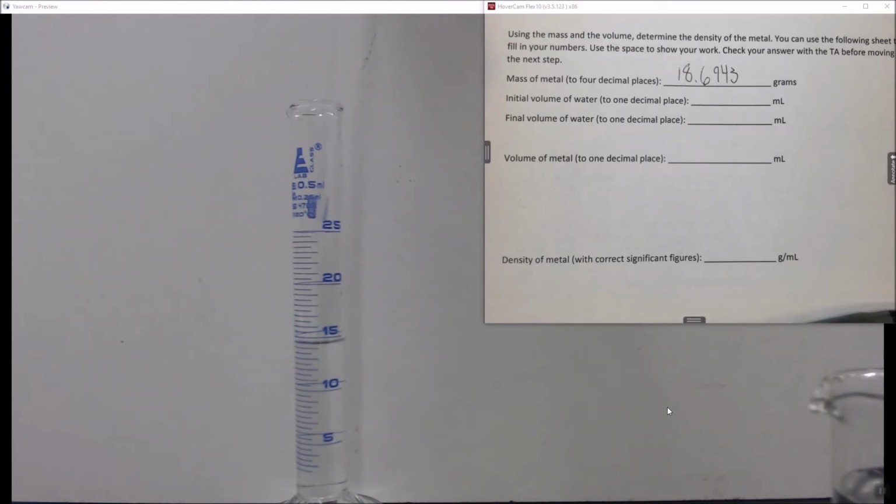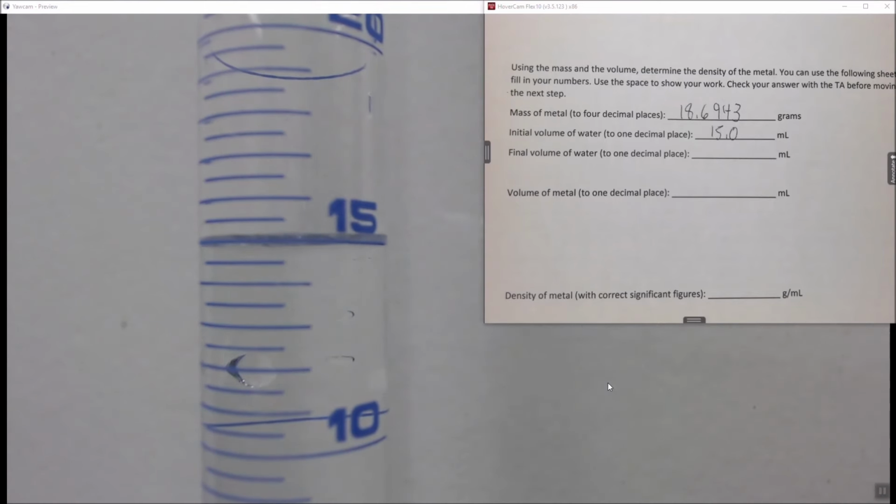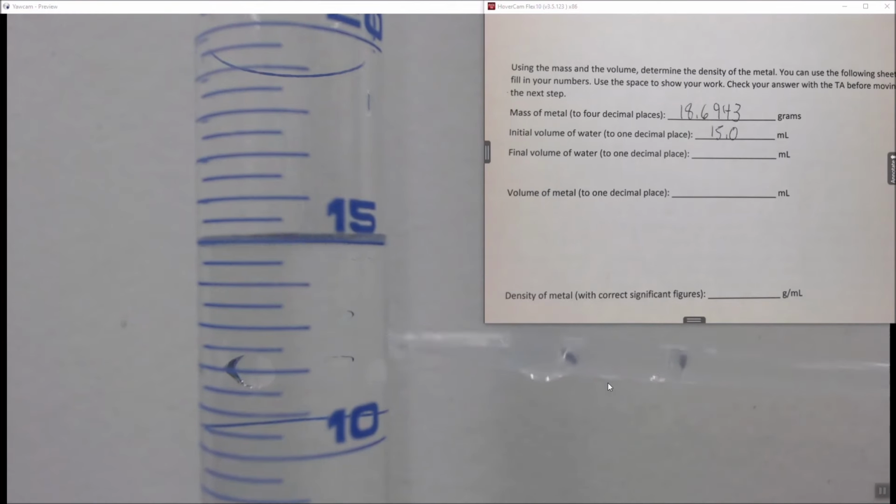which I am doing behind the camera. Then you take your pipette and you carefully drip until that water is resting on the line. So now that we've moved the camera in a bit, if you'll note, when I tap this, you see this little surface of water here. It is curved. That's called a meniscus.